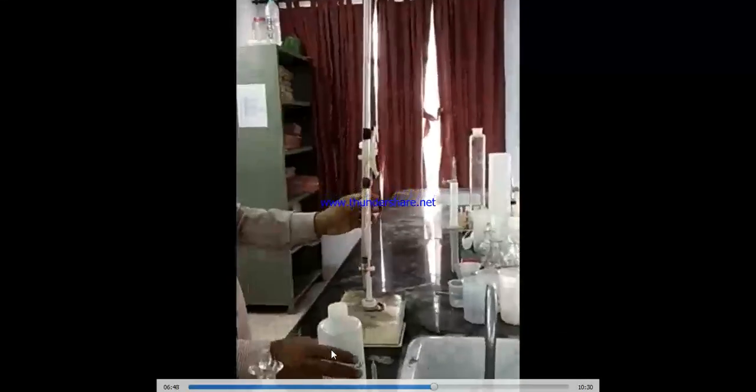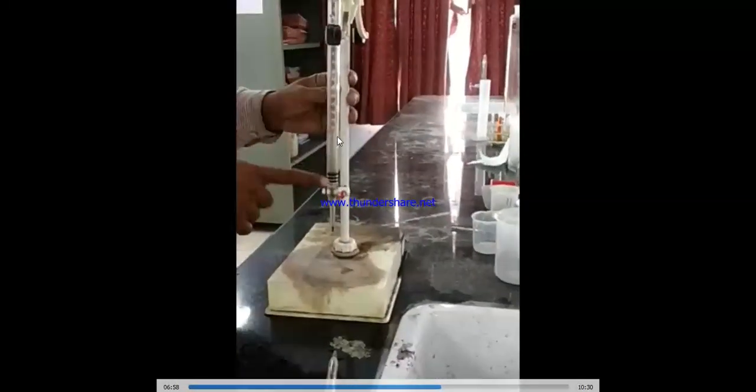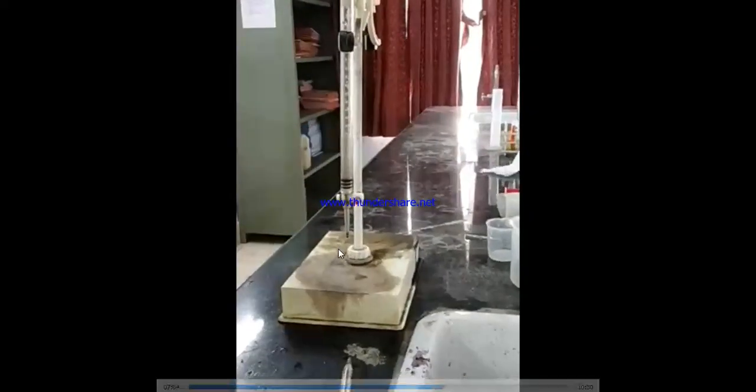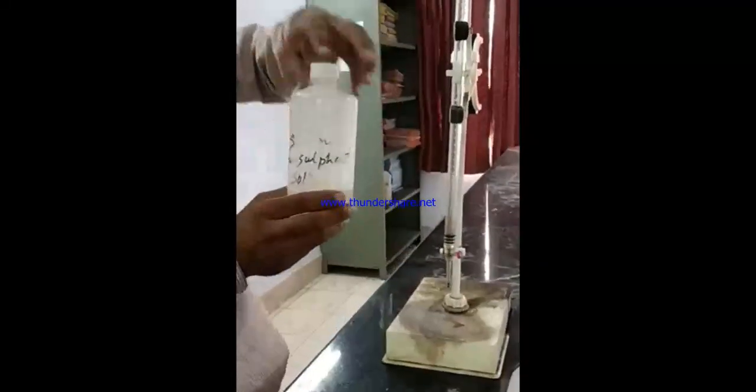Now standard sodium thiosulfate solution, 0.025 normality, we will put into this burette. This is on, we will turn it off, otherwise liquid would fall. और हमने इसकी height भी बढ़ा दी, sir is showing that it is close now. Okay, standard sodium thiosulfate solution 0.025 normality.